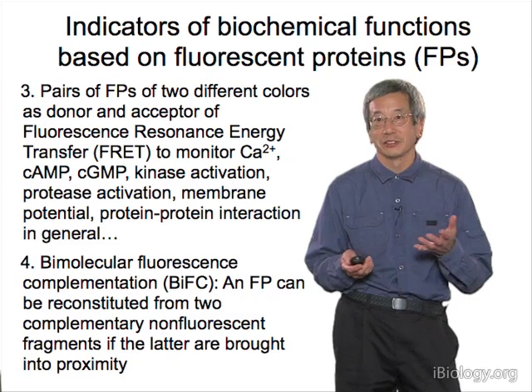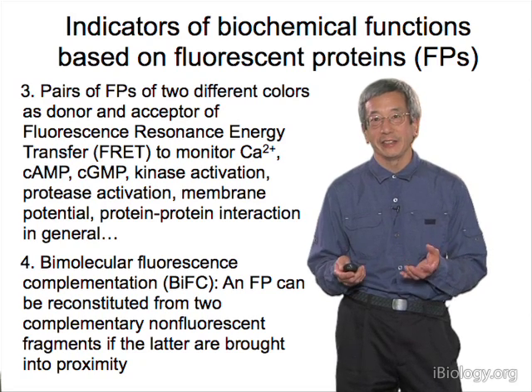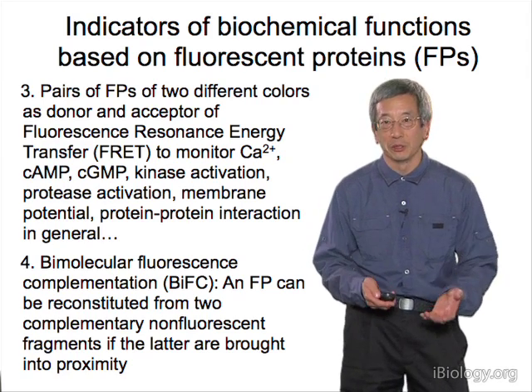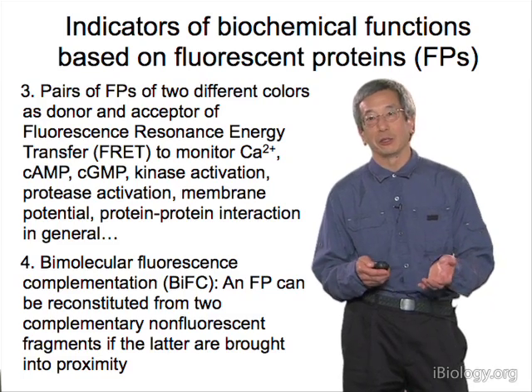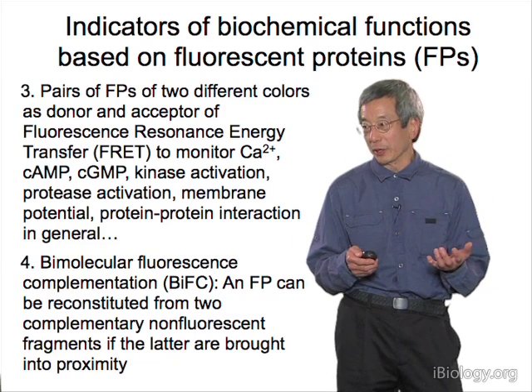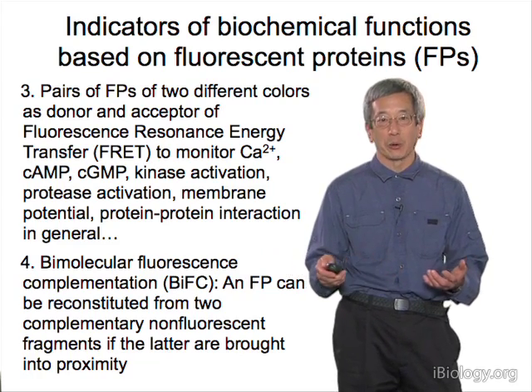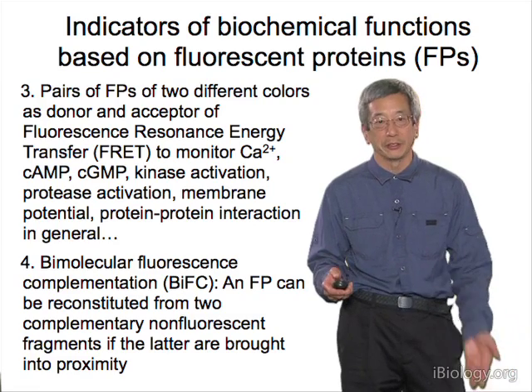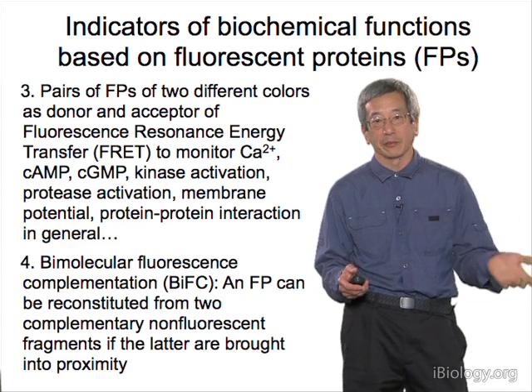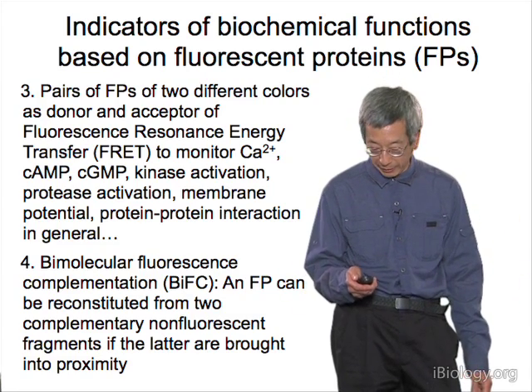And in a way, I should remind you, FRET is somewhat similar to the basic way that the GFP in the jellyfish took the energy from aequorin. Aequorin glows blue. In that case, it's not fluorescence, it's bioluminescence, but once you make the excited state, it doesn't matter. And what the jellyfish modulated, to change blue to green, is what we deliberately modulate in order to measure all sorts of signals ranging from calcium, cyclic AMP nucleotides, protein kinase activation, the activation of proteases, even membrane potential, and all sorts of protein-protein pair interactions.